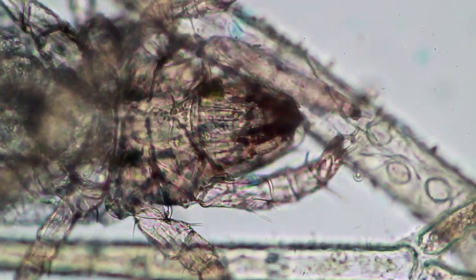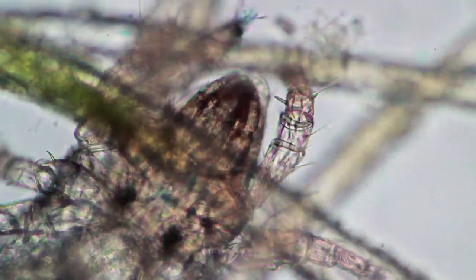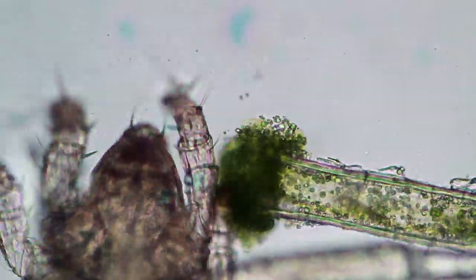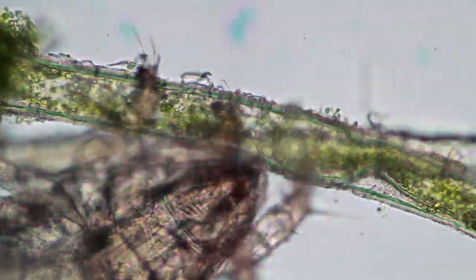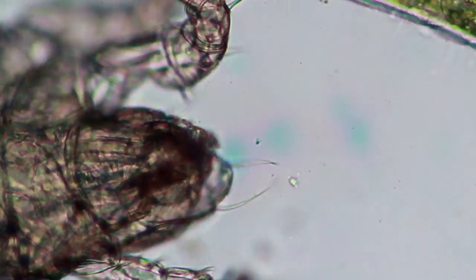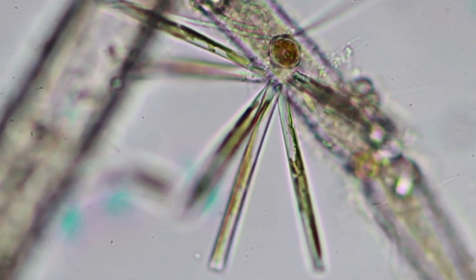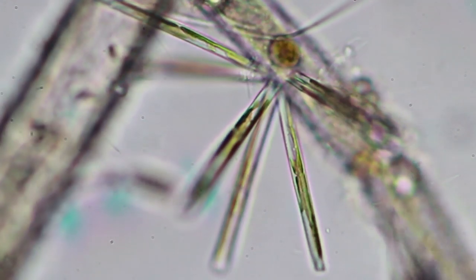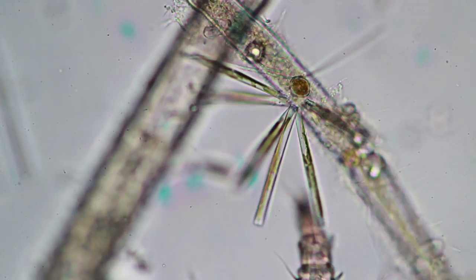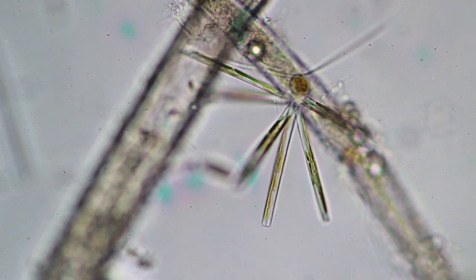Here's a close-up again, also a little bit in time lapse, and you can very nicely see how it is moving its mouthparts along and clinging on to those algae fibers. Quite interesting to see these things so highly active. Look at this algae here — the green algae was cut open, so some of the cell contents actually spilled out. These here are diatoms growing on an algae, and on the bottom you can see the mite as it's trying to move along.